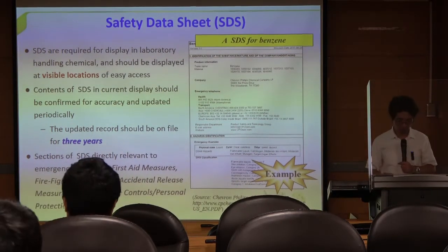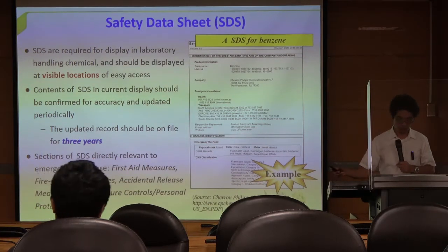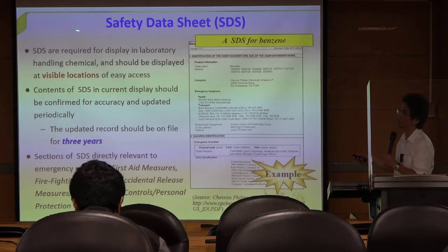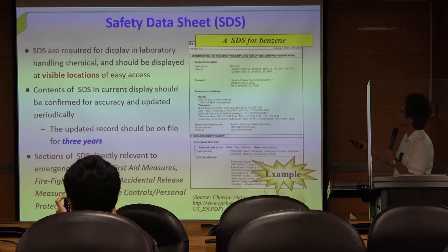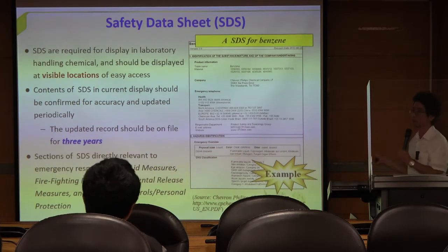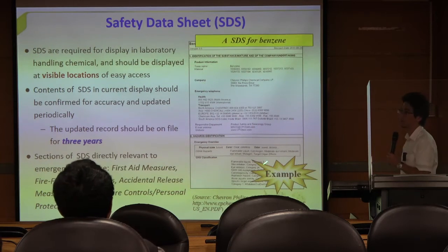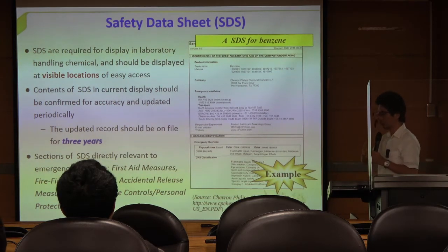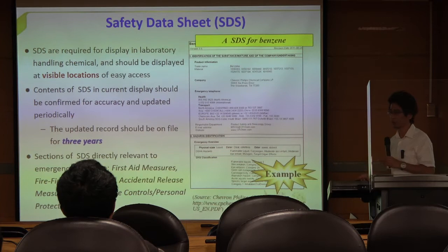So after the video, you know the SDS, the safety data sheet. Four years ago it was called the material safety data sheet, but now they have corrected it to the safety data sheet, no M. Technically, you should print out all the SDS for your chemical reagents, all of the reagents stored in your laboratory, so if a bad situation happens, you can get the SDS immediately.